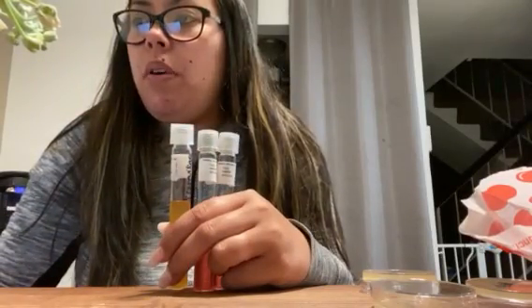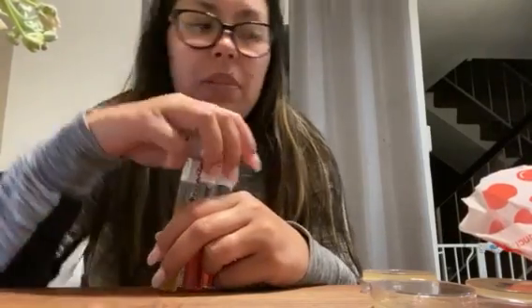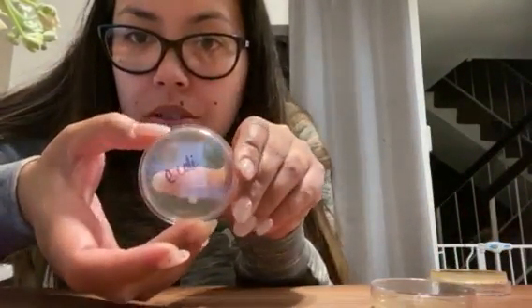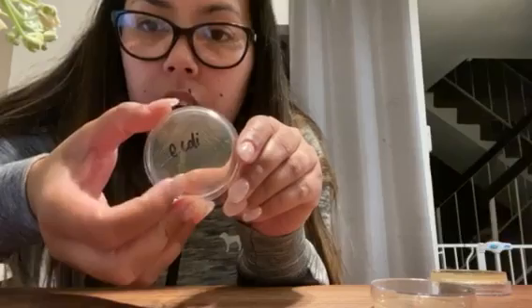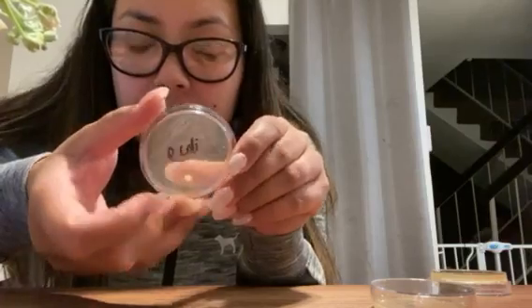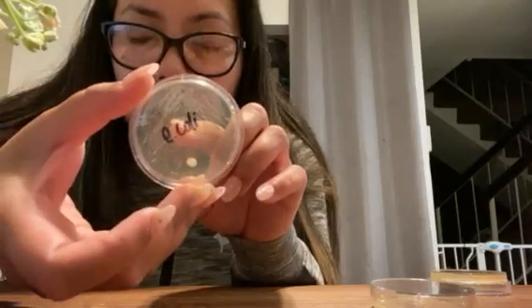So for the second part, when we developed the cultures into the agar plates, the samples came up with the streaking. I'll start with the E. coli. So you can see the streaking on it, and you can also see one big spot there of bacteria forming. And where I did the streaking, it's in a dotted pattern, but you can see where growth was occurring.